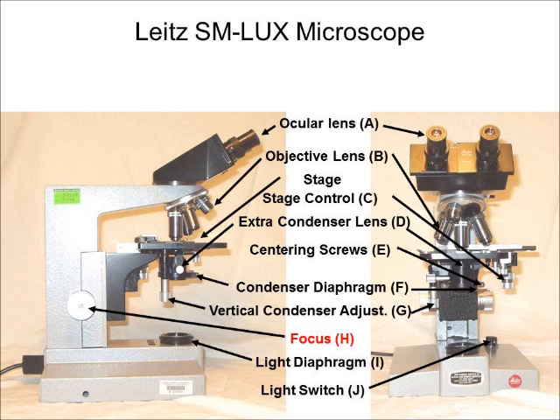On the side of the microscope is the focus knob, which alters the distance between the objective lens and the slide. This is the adjustment that you will be using the most.